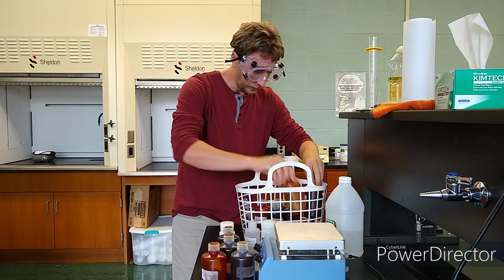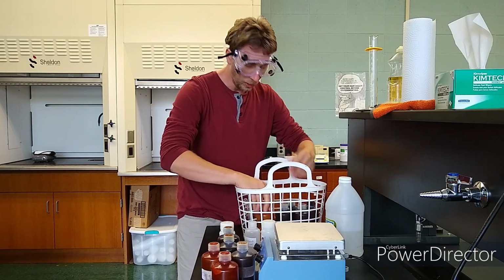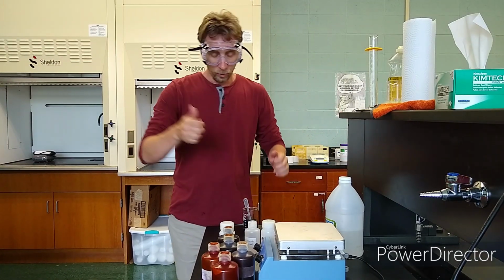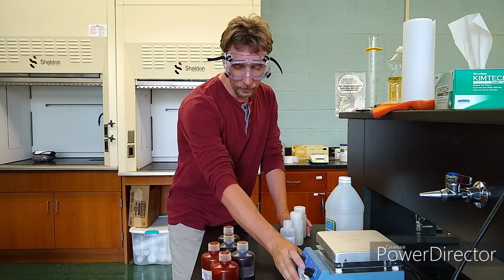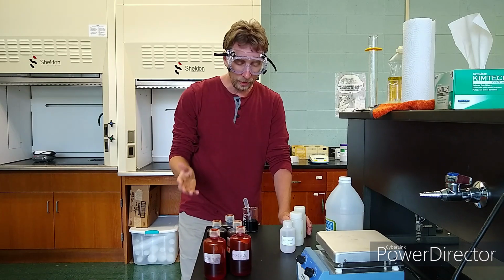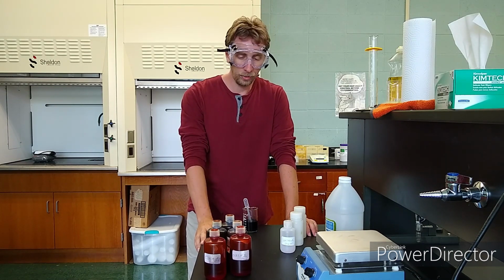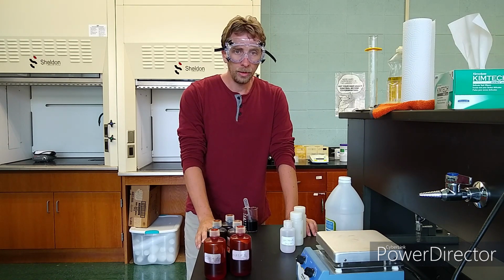These all have something in them. That one's full, so that's a lot of iodine just to dump down the drain and not use, for one thing. For another thing, it saves me a lot of work if I don't have to mix up a new solution of iodine every trimester. And so, again, we're not looking for ultra high precision for this introductory lab, just something that is demonstratively useful and reasonably accurate.